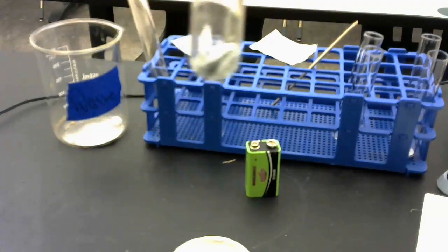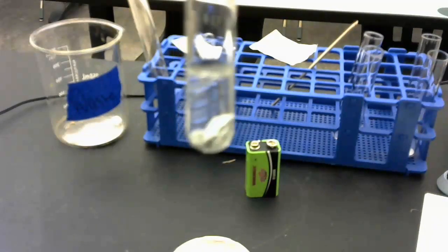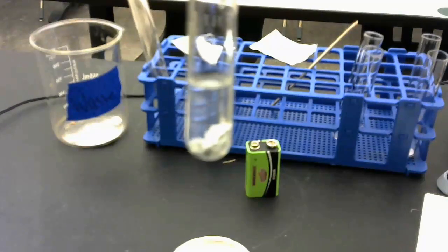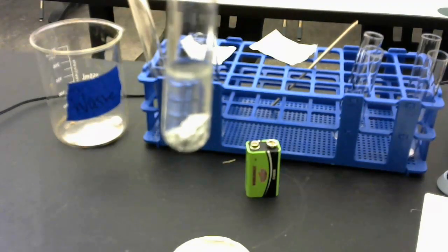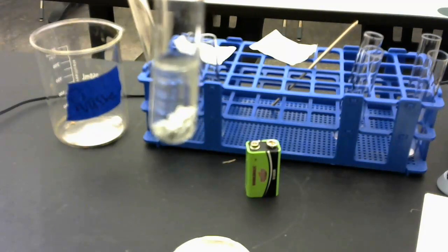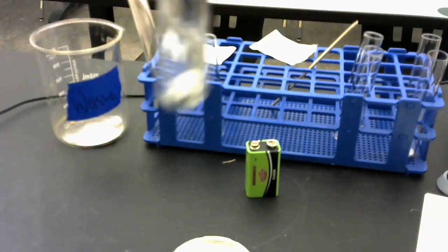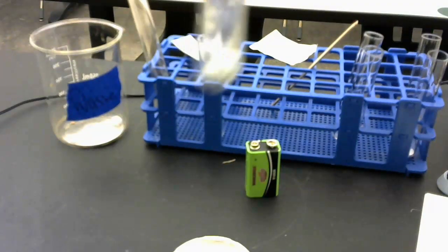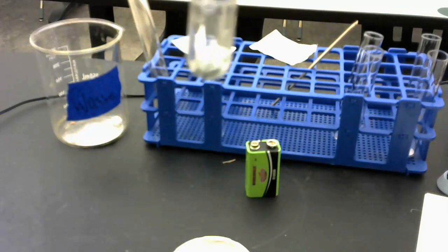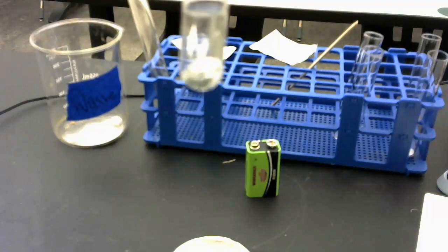And I have my hydrochloric acid in there, and you can actually see bubbles coming up from that, which means that the hydrochloric acid is reacting with the zinc. Hydrochloric acid reacting with zinc. And again, this is a single displacement reaction. So the hydrogen and the zinc are switching places, basically. So hydrogen gas is produced, and then zinc chloride is going to be produced.